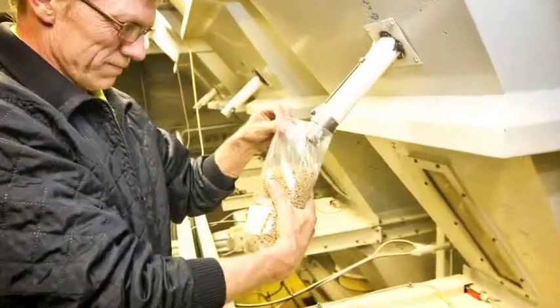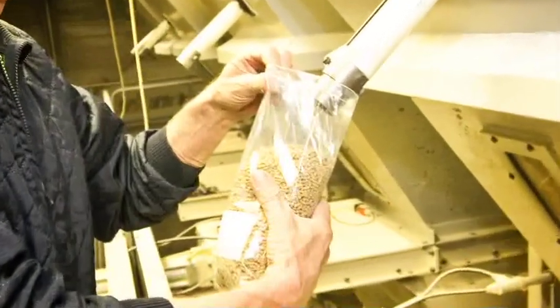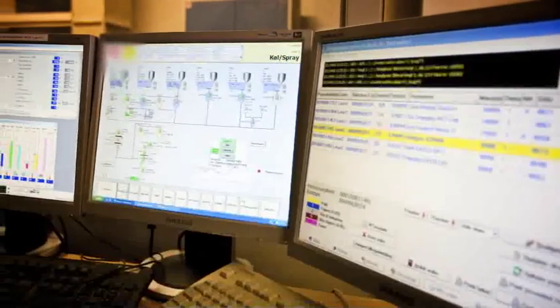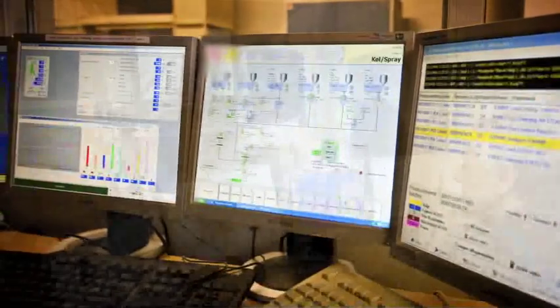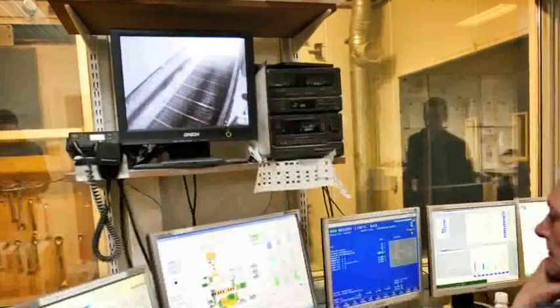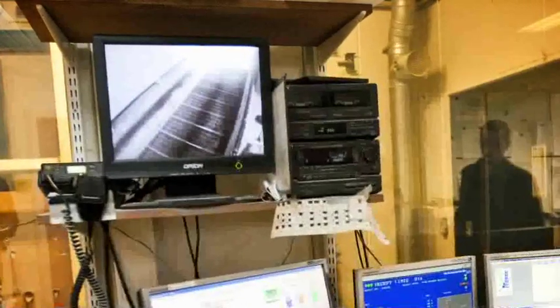You can say, okay, we have the raw materials, and we have the mix of the raw materials. And then, of course, if you go further into the process, then you make pellets and you maybe add fat. And yeah, there are a lot of steps. So to identify the most critical point is the first step, as I said before. Here we can say, in some types of feed, one of the main or important parameters is, of course, protein.